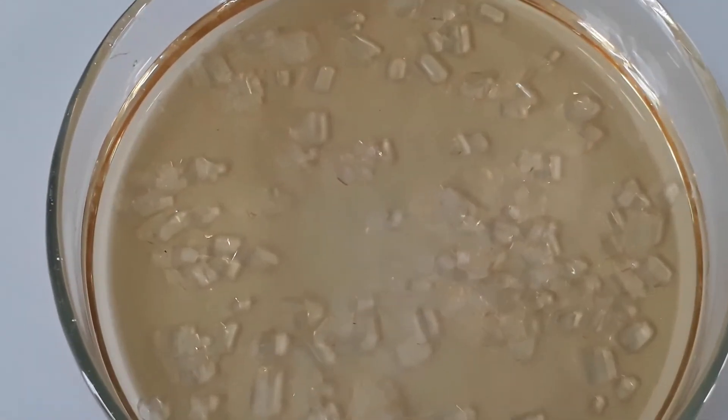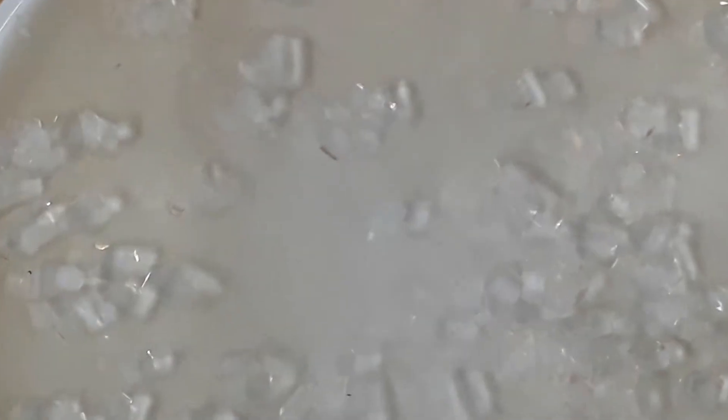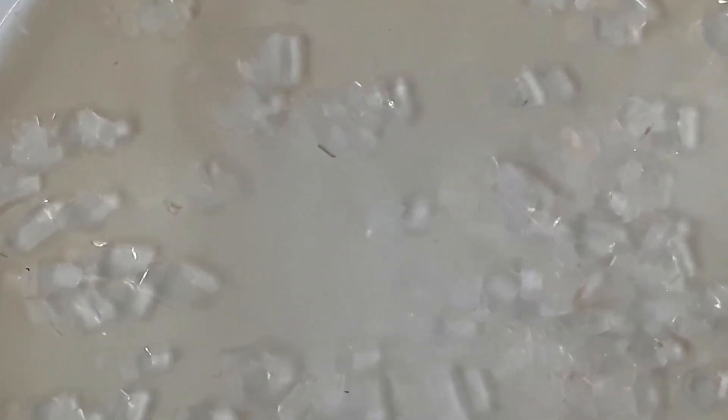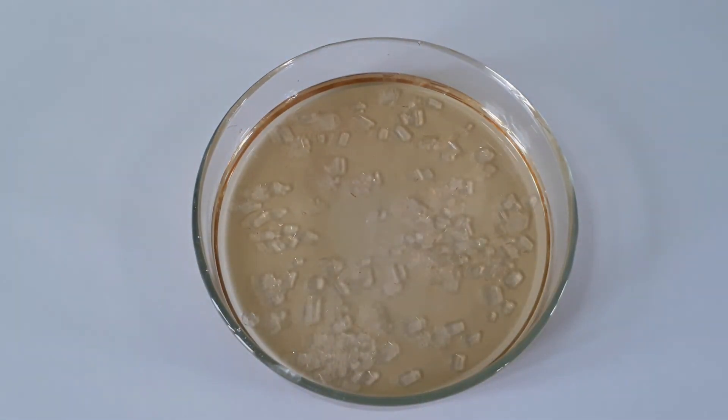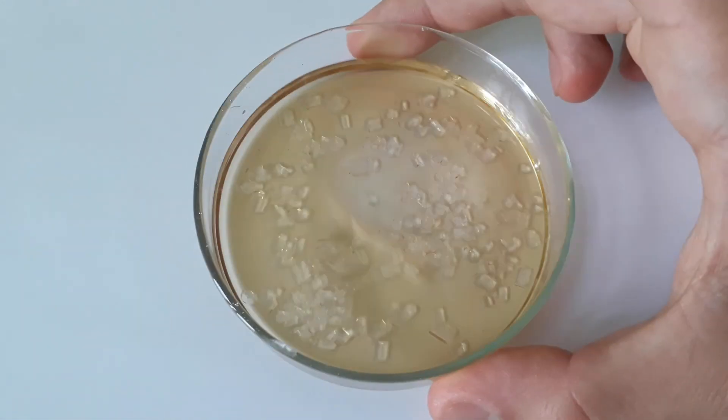And also adding to my yield are these surprise crystals from the mother liquor. They are so massive, it's really cool, and I didn't at all expect to get such good quality crystals from the mother liquor. These crystals bring the whole yield up to around 30%, which is pretty acceptable, I would say.